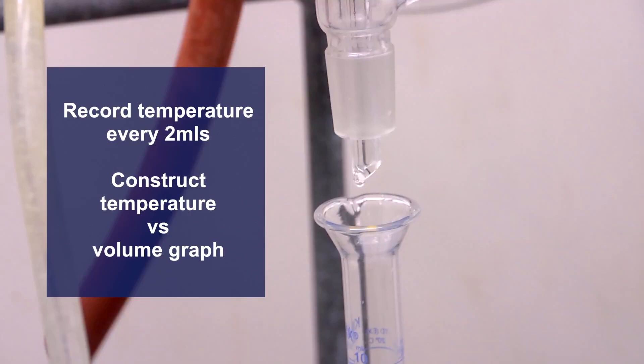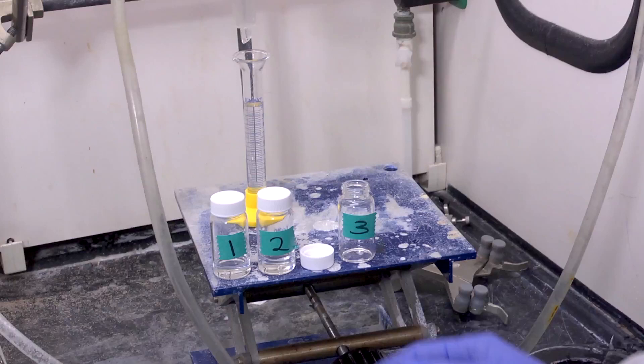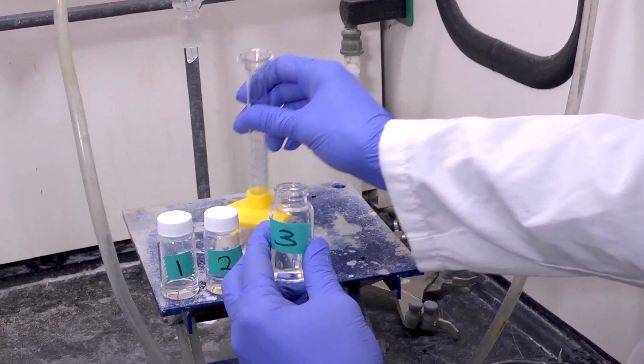With your recorded data, construct a temperature versus volume graph. The first 10 milliliters collected are fraction 1. Pour fraction 1 into a labeled vial and proceed to collect the next 10 milliliters for fraction 2. Pour fraction 2 into a labeled vial and collect the last 10 milliliters for fraction 3. You will collect three 10 milliliter fractions of distillate into three separate vials.